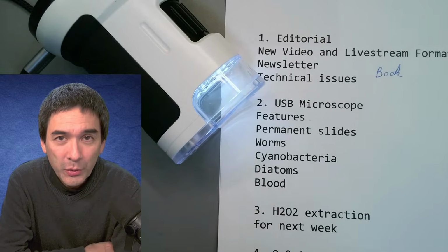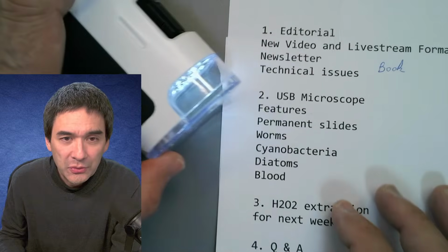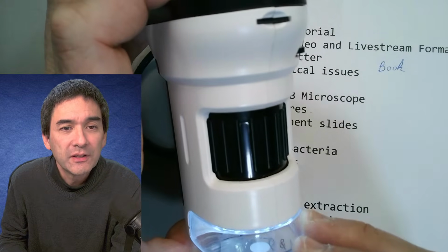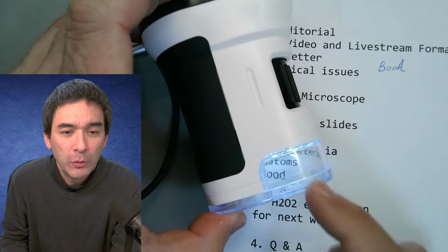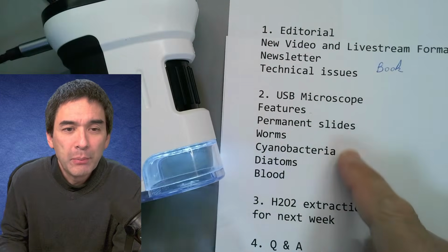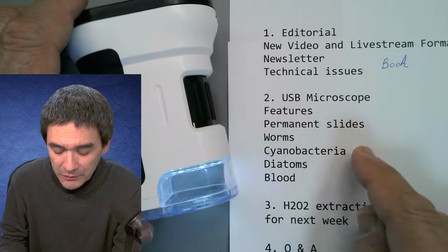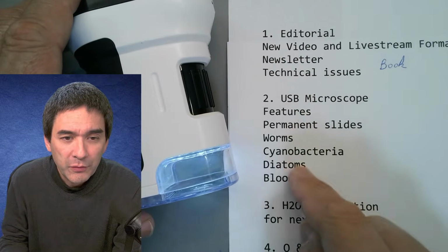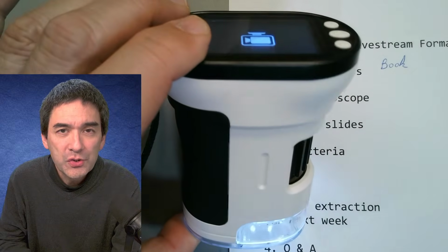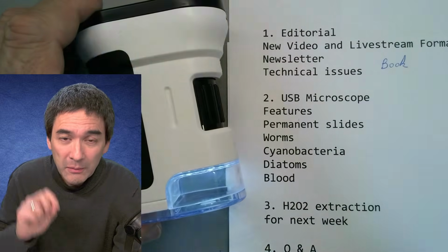I'm happy that you could join me today, and I just would like to inform you quickly on what I plan to do today. As already announced, I've got myself this fairly cheap USB microscope. I'll be showing this to you today. It's going to be the main part, so I'm going to look through the microscope. I connected it to the computer. I'm going to put a few specimens under this USB microscope, and we're going to see how it looks in comparison to my real microscope.